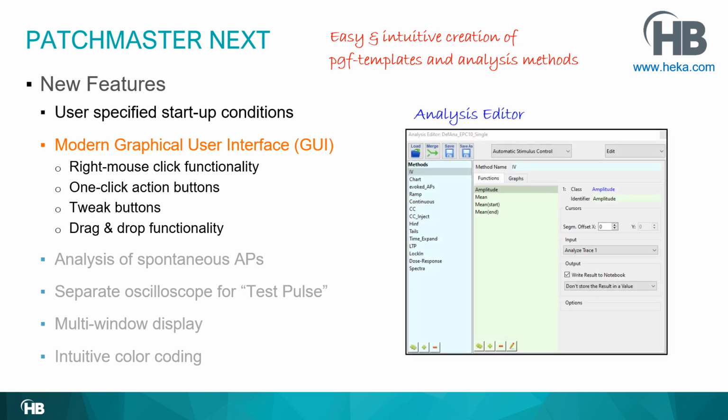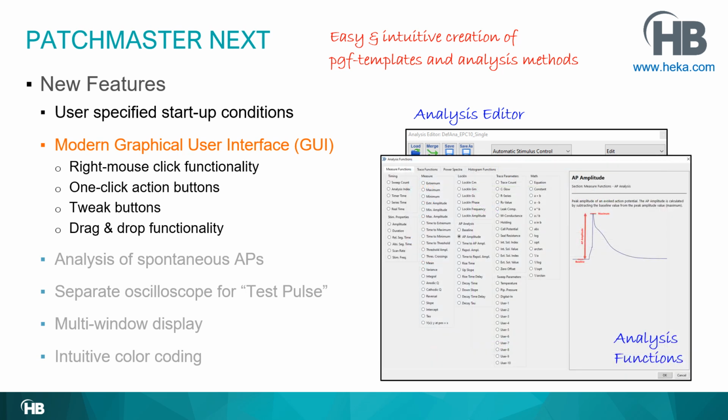Then the analysis window, also very easy to use. Again, you have many different methods, and each analysis method can have many different functions that are all executed at the same time. And those functions are available down here. When you click on this editor button, the analysis functions window pops up, which allows you to select different analysis functions.